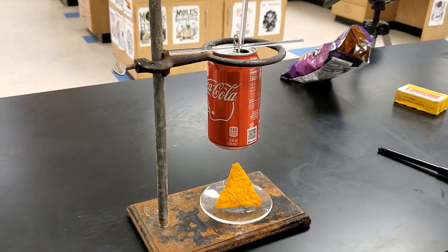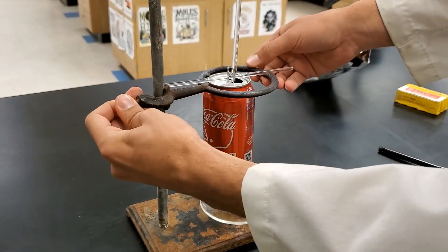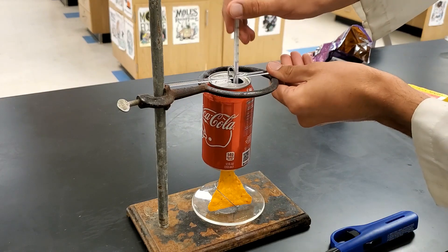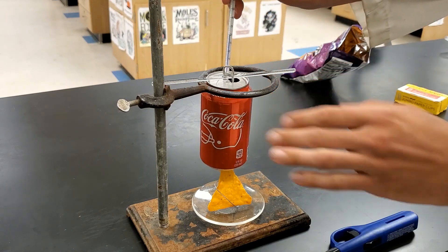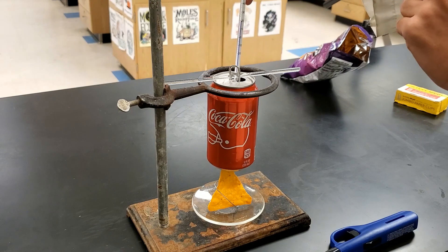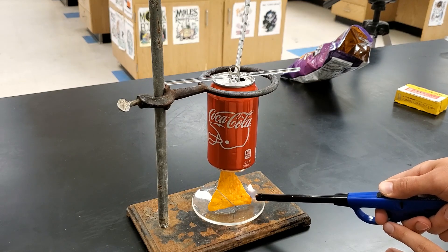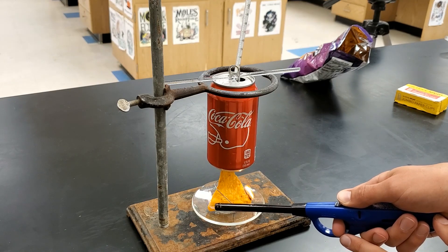Now comes the fun part — actually burning the chip. Make sure your can is suspended directly over the chip. We want all the energy from burning the Dorito to go into the can. I'm going to use a lighter, light this Dorito, and as it's burning just use your thermometer to stir a little bit and make sure the heat is distributed. We'll keep an eye on the temperature and record the highest it reaches. Make sure you're not touching the bottom or sides of the can — we want the temperature of the water, not the can itself. If you do this at home, you'll experience the lovely smell these Doritos give off.